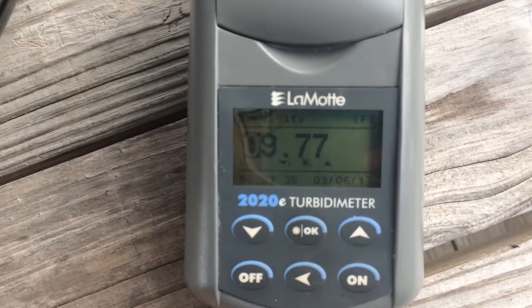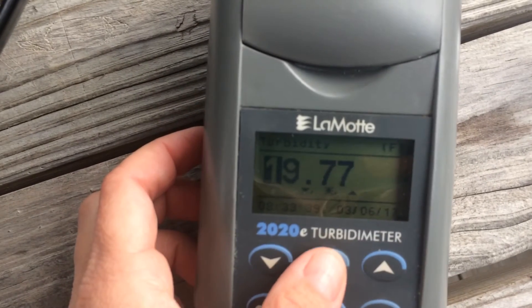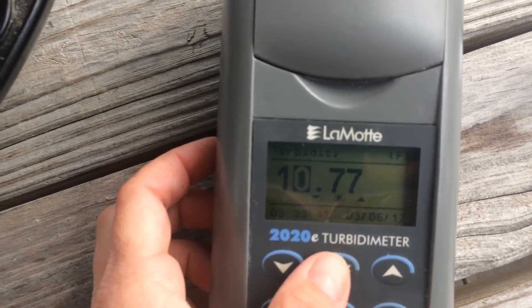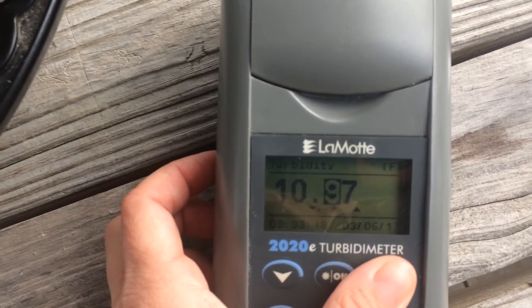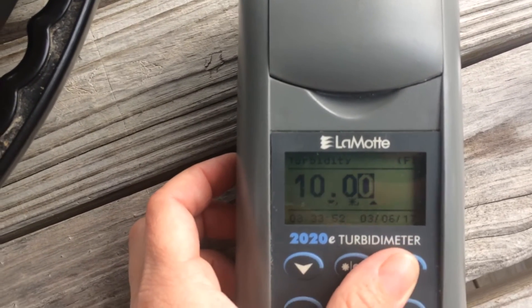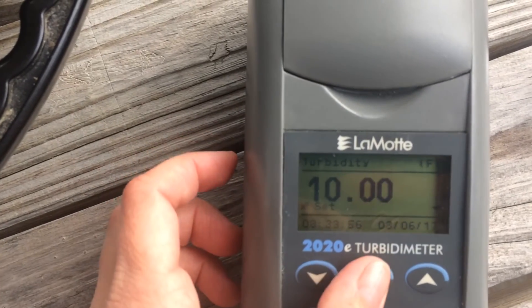Now you change the numbers to make it ten. Hit okay to go to the next digit. It needs to be a zero — hit okay to go to the next. Continue hitting okay through the remaining digits. When it says set, hit okay.